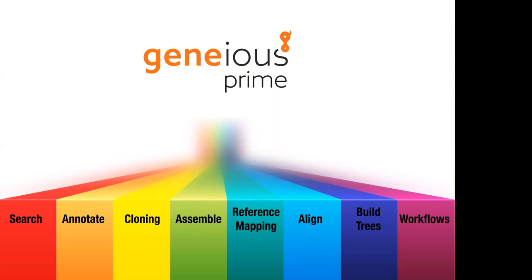There's lots of tools for annotation, so you can create annotations, you can import them. There's ways to automatically transfer annotations between a sequence as well. So you can create like a custom annotation library in Geneious and use that to annotate new sequences.